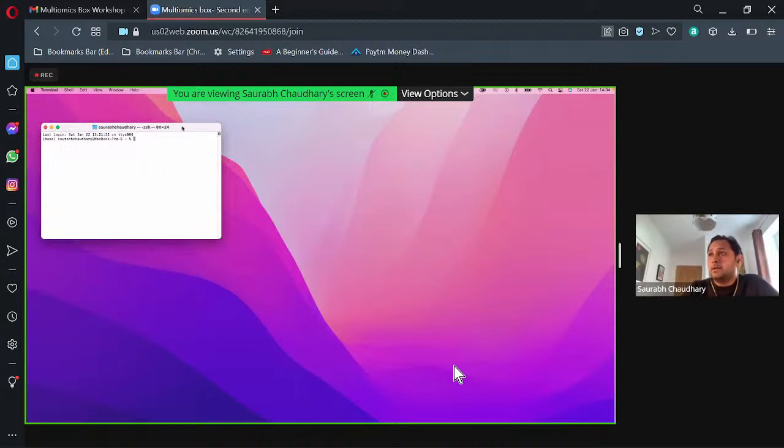If you don't have a Unix or Linux system and you still want to perform this on your Windows laptop, you need to go through Galaxy. With Galaxy, you can generate the Salmon quantification files. Those Salmon quantification files we are going to use in the next session in R, where we perform the differential expression analysis.